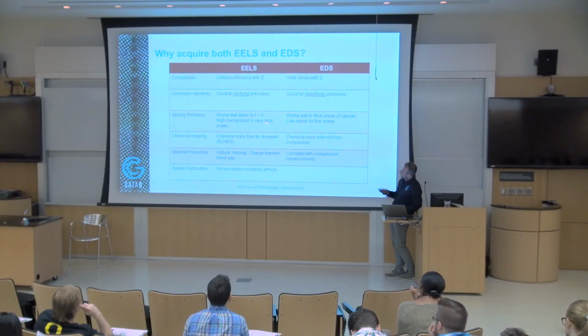EELS is really good with thin samples. It's really good when the thickness is close to zero. Say that you're looking at 2D materials. They are only one atom thick.